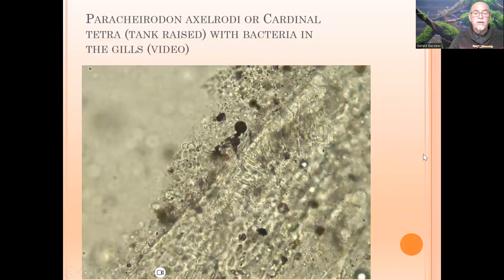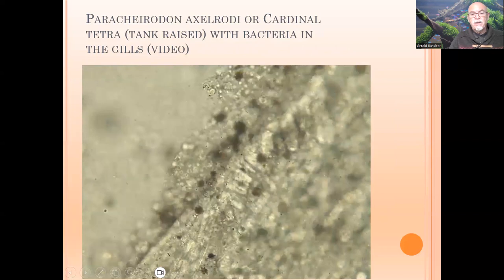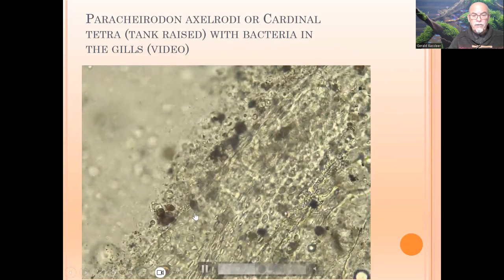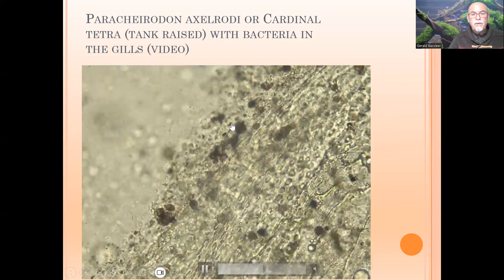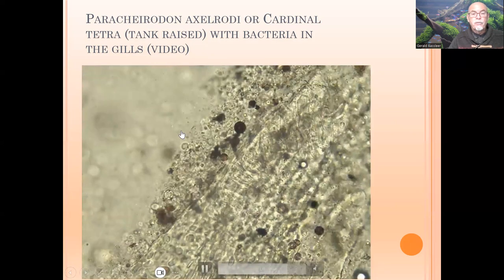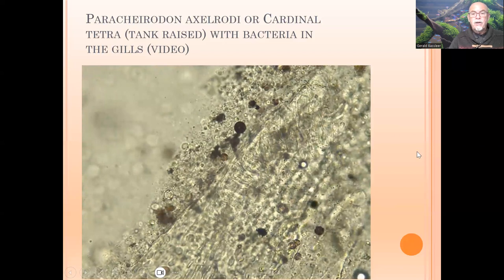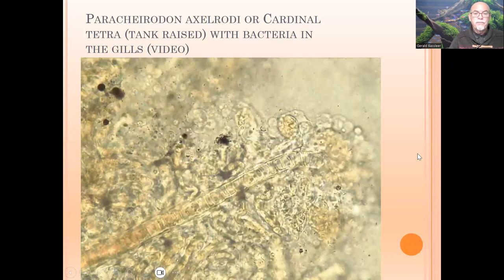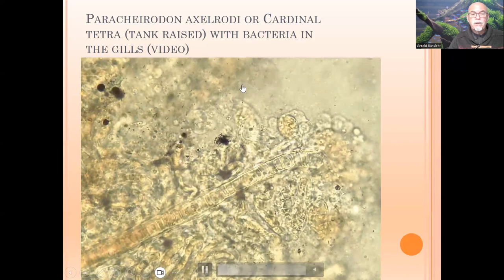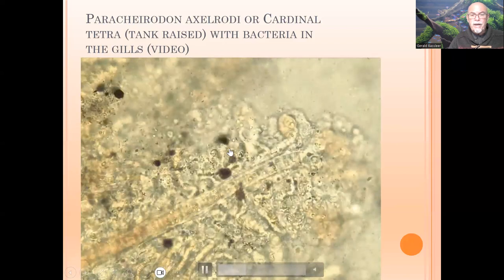Let's go in detail. I show you the video here on the gills of the fish — all those black colonies, and the millions of bacteria in the black little dots swirling and moving around in the water. They are covering the healthy tissue and not allowing good respiration. Here we see more bacteria, different kinds of bacteria, little stag bacteria. Here are many bacteria — all the black spots.